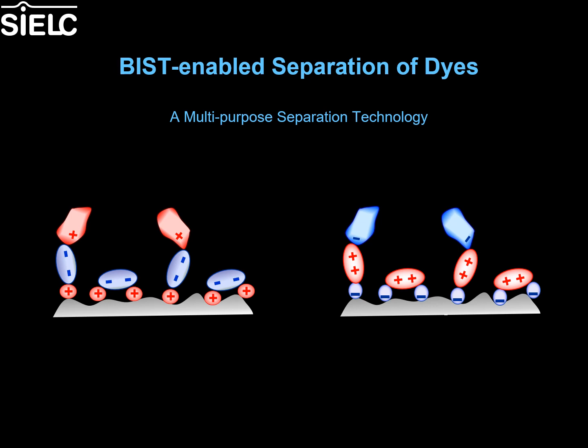Hello, this presentation is going to serve as a summary on the work of separating dyes using BIST, which is a new multi-purpose separation technology developed here at SIELC.